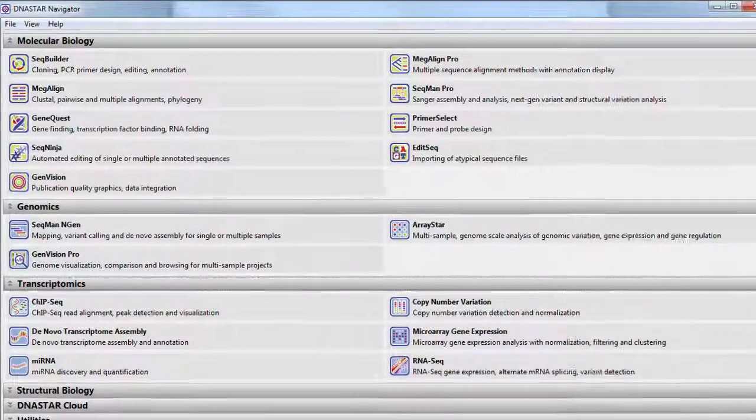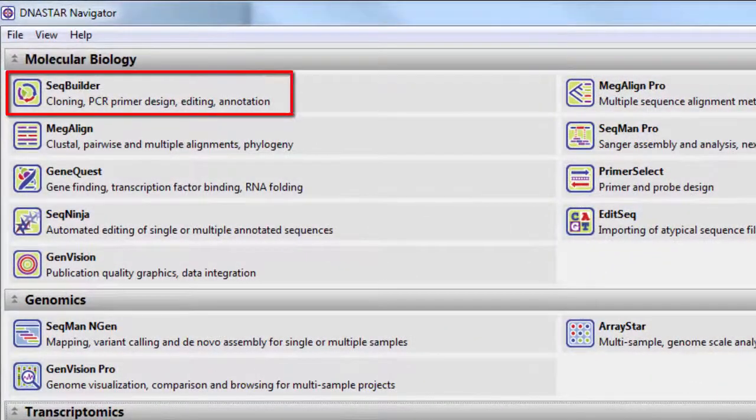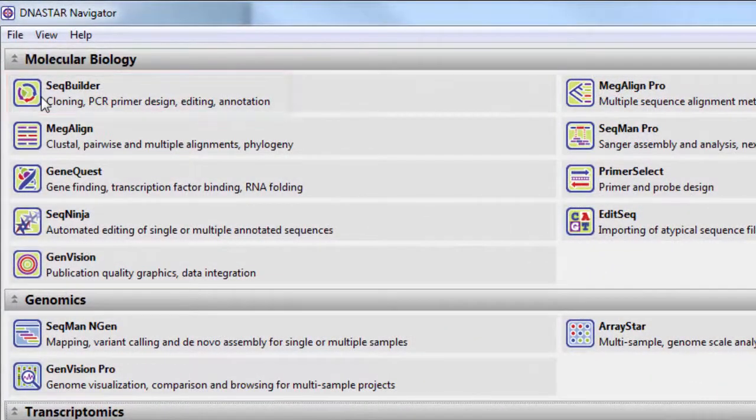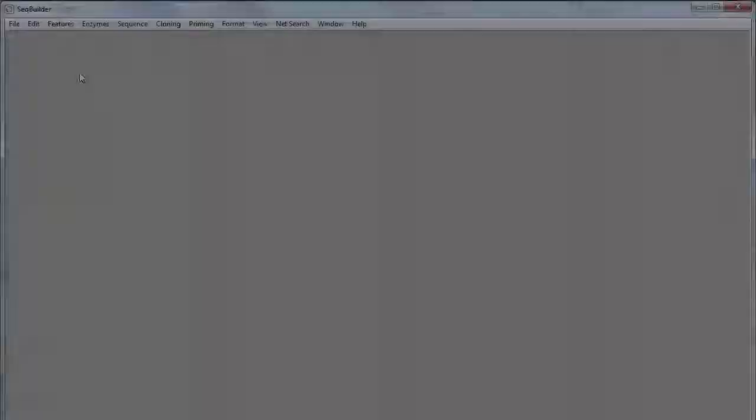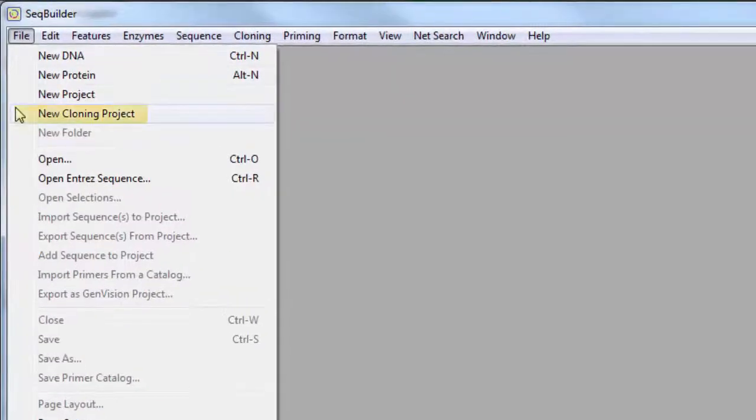To create a virtual clone, start by launching SeqBuilder. Then create a new cloning project.